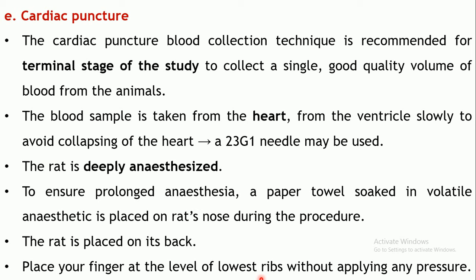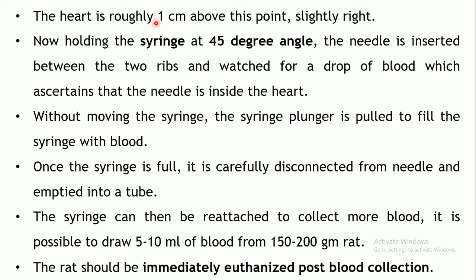After anesthesia, the rat is placed on its back. Place a finger on the lowest rib without pressure to locate it — the heart is located roughly one centimeter above this point, slightly to the right. Take a syringe, hold it at a 45-degree angle, and insert the needle between the lower ribs. A drop of blood oozing out indicates the needle is in the heart. Without moving the syringe, pull the plunger to collect blood.